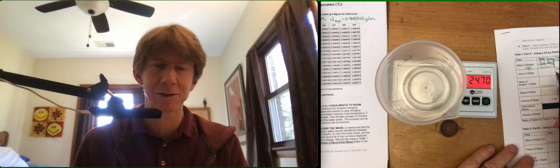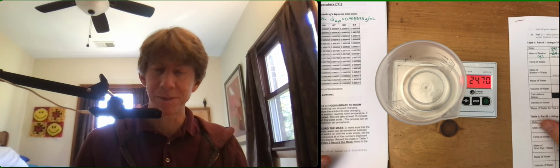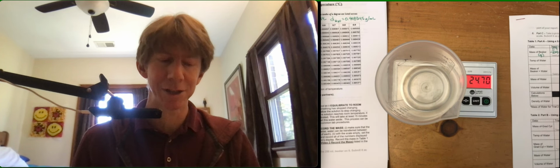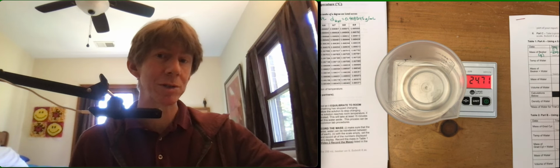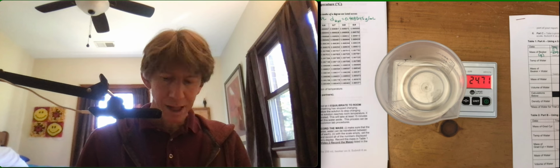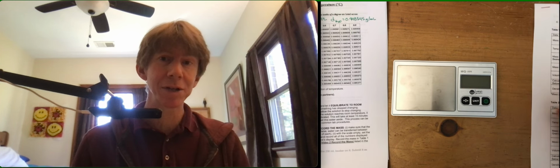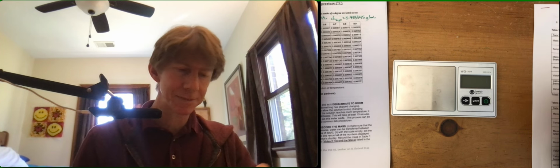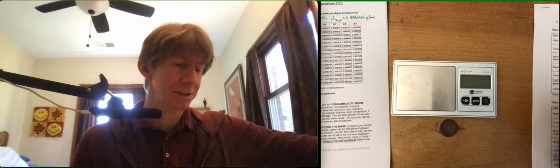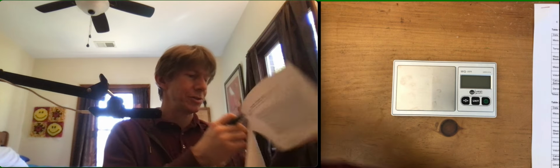And we single cross out so that you can still see the results afterwards in case there's a mistake and you need that value again. You never obliterate or destroy or erase. And we're always writing our results in ink. All right, so, and I'm gonna keep my scale right there so that I don't move it. That's another good idea, is set your scale in one place, because if you move it, it can lead to small changes. All right, take a picture. I told you to do that.